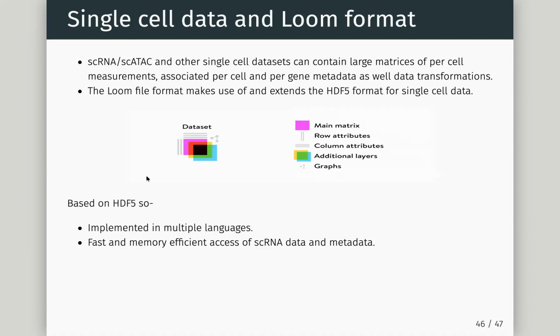One place we're going to see this straight away is in single cell. I showed you these BAMs, I showed you these bigwigs and all this. Single cell is quite sparse, so bigwigs often aren't particularly useful, though there are ways that they are useful. But one of the first things you will see is this type of format. You won't even see the BAM. A lot of people will just get this type of format, and then you will start to work from this. So this really is a very important format if you're working with single cell.